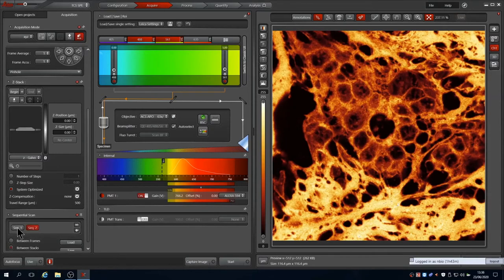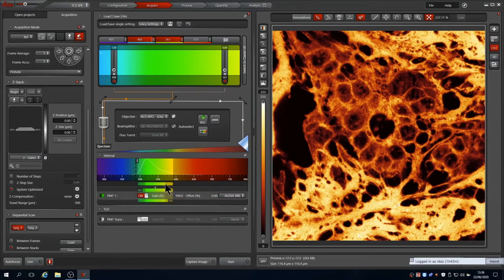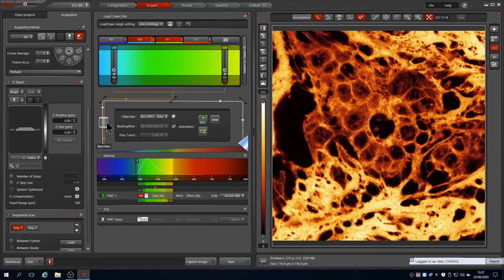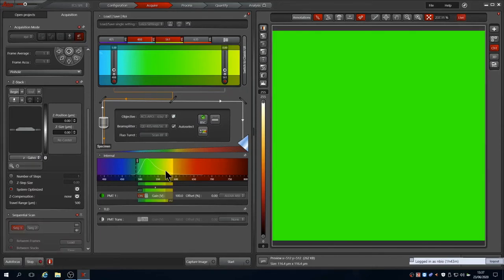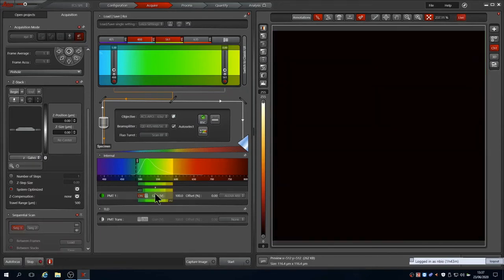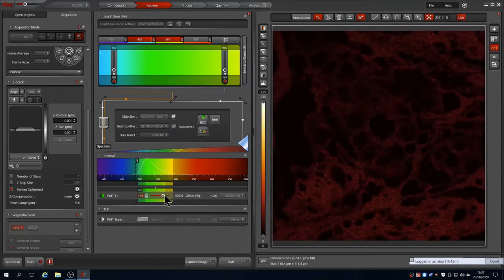Now repeat the procedure. You'll see that the gain is back on 100V for this channel and the 561 laser is off with the 488 on at 1%. Press Live to start scanning.